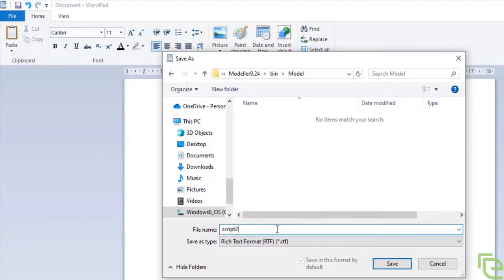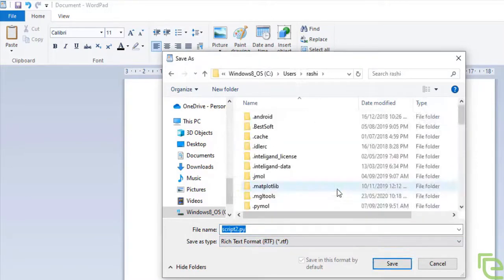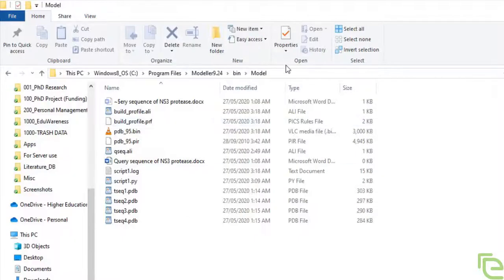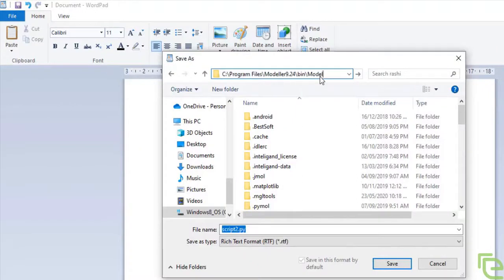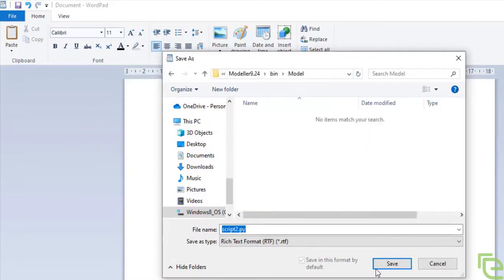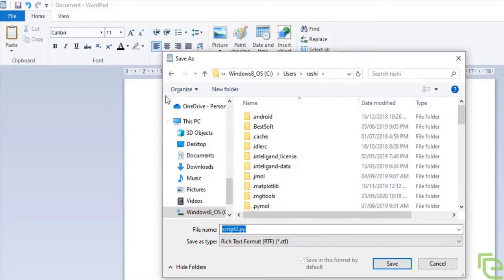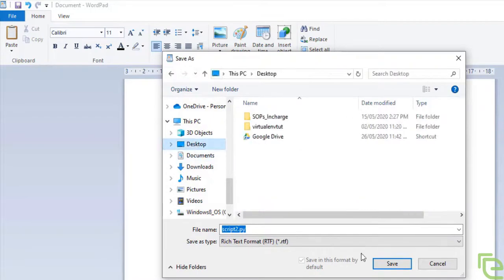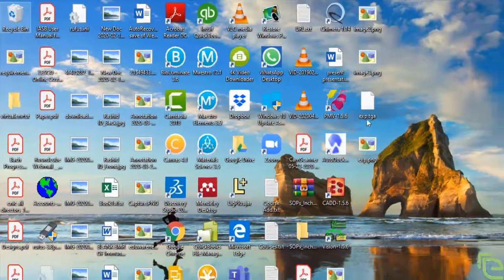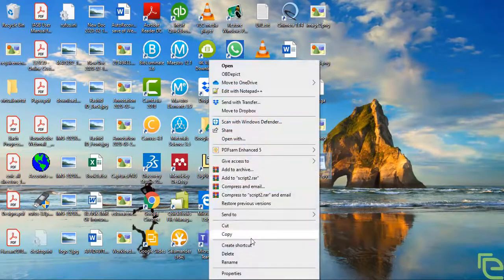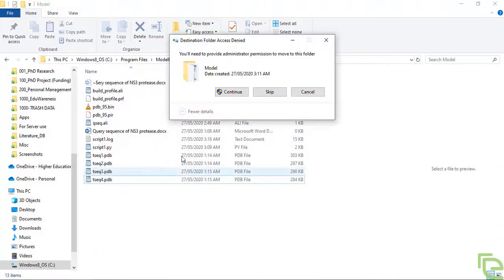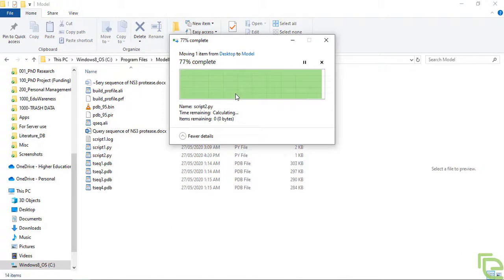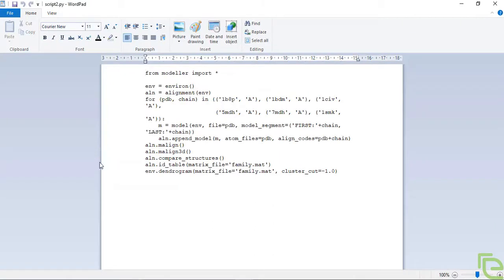It's giving me an error due to administrative privileges. We will save it in desktop and then copy it. Script 2 has been pasted here.